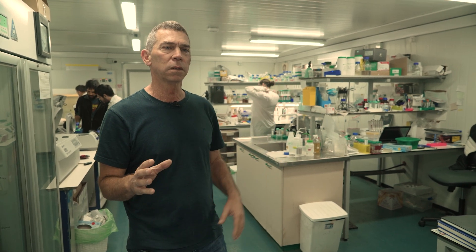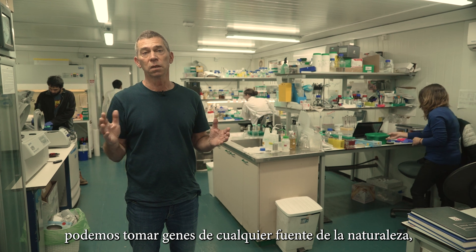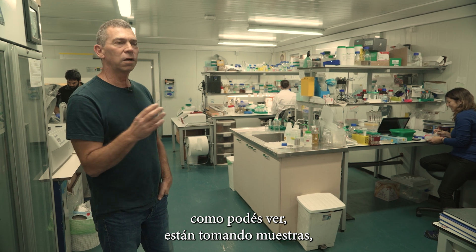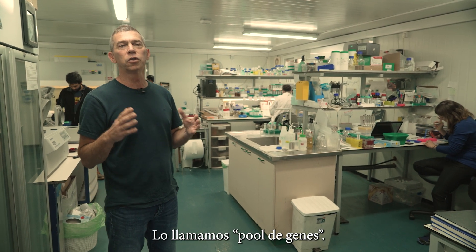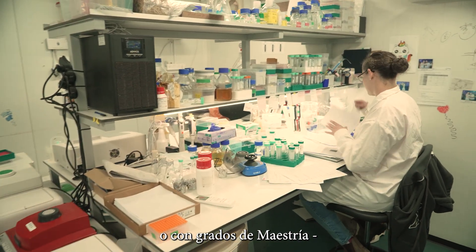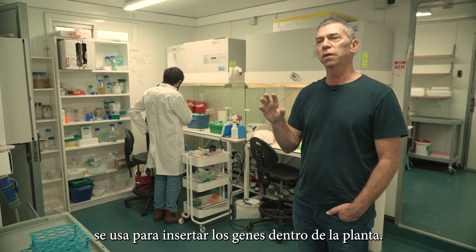Here is where everything begins — our methodology. We developed a platform to check genes from nature, so we can take many genes from any source in nature, from any ecological niches, and bring them here to the lab. Here in the lab, the researchers are taking the samples and producing millions of genes together, like a soup of genes. We call it a gene pool. The gene pools are put inside special bacteria, and the bacteria will be used to insert the genes practically into the plants.